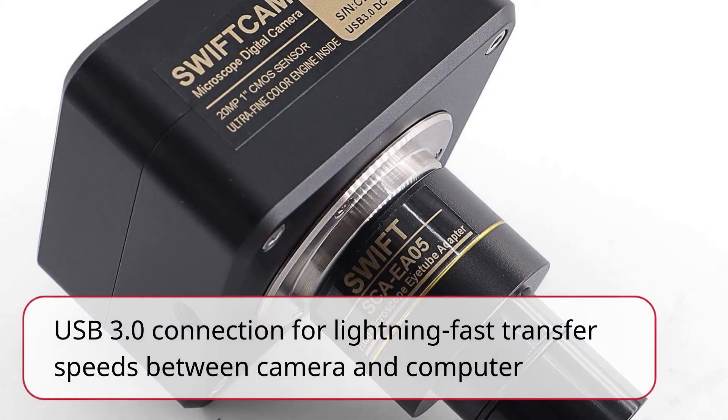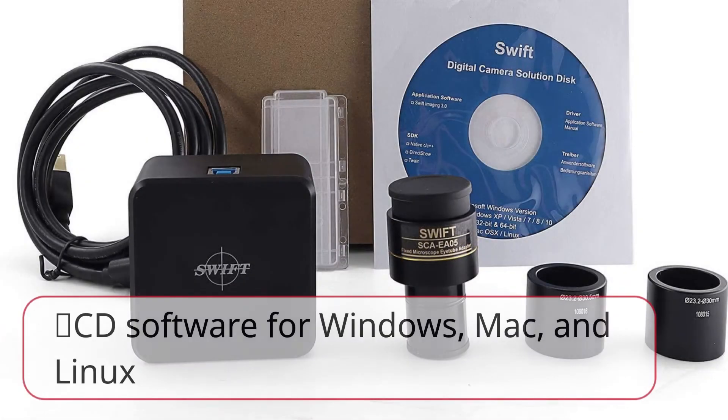USB 3.0 connection provides lightning-fast transfer speeds between camera and computer. CD software is included for Windows, Mac, and Linux.